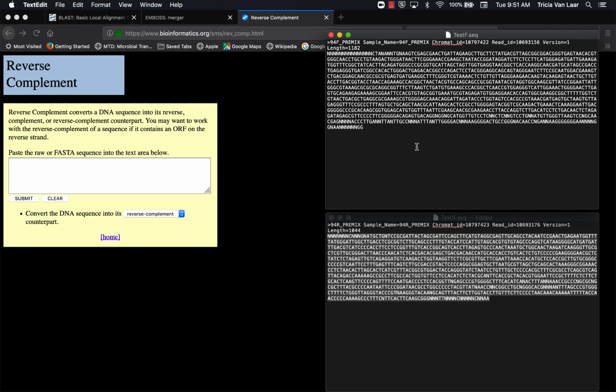We then would send those tubes, one containing the forward primer, one containing the reverse primer, to a company called Eurofins, and they do what is called Sanger sequencing. We talked about Sanger sequencing in lecture, so I will expect that if on your lab practical you are asked how Sanger sequencing works, you should be able to explain it. It is also known as dideoxy sequencing, so it is important that you understand how that works.